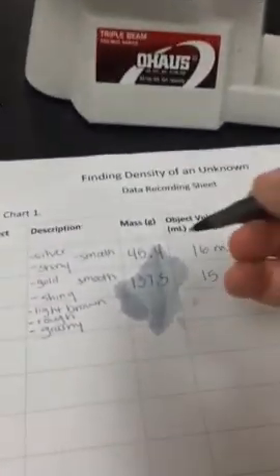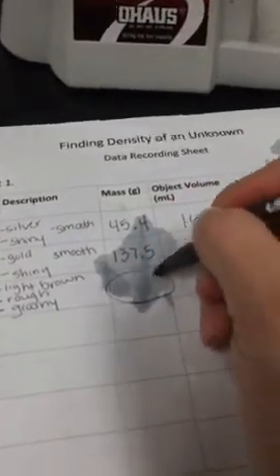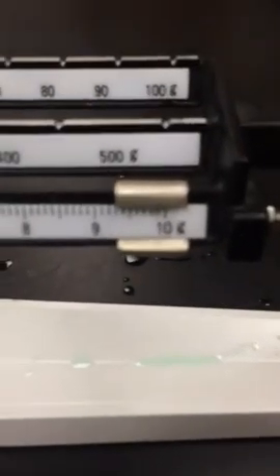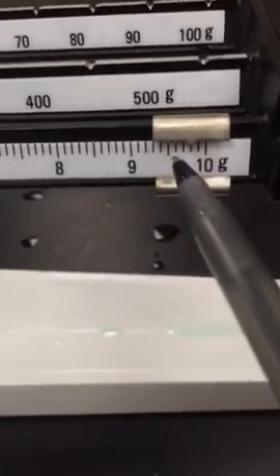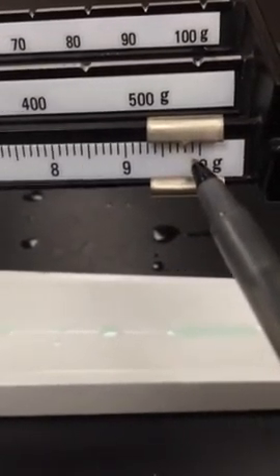Okay, and you want to write down your mass right here. I'm not going to write it down this time for you because I want you to write it on your own. Again, this weighs 9.8 grams.